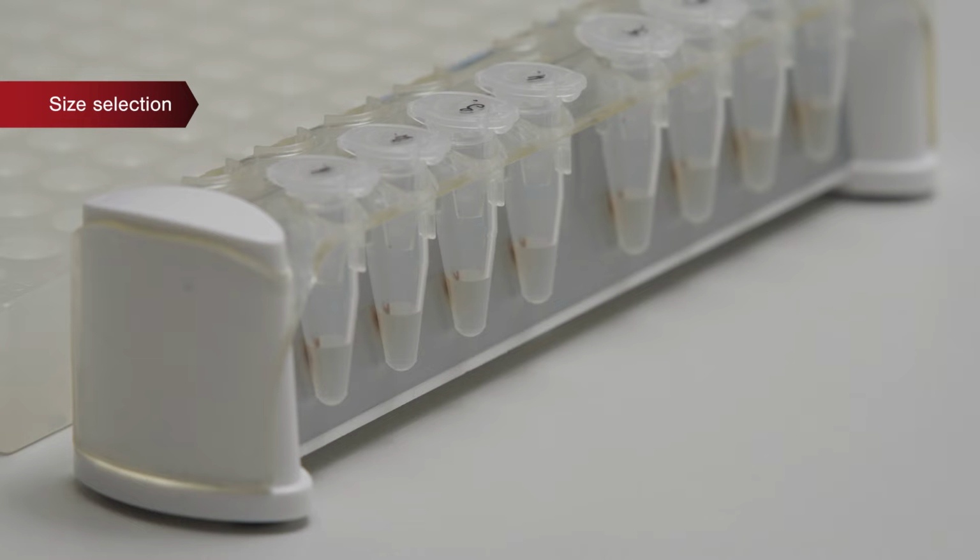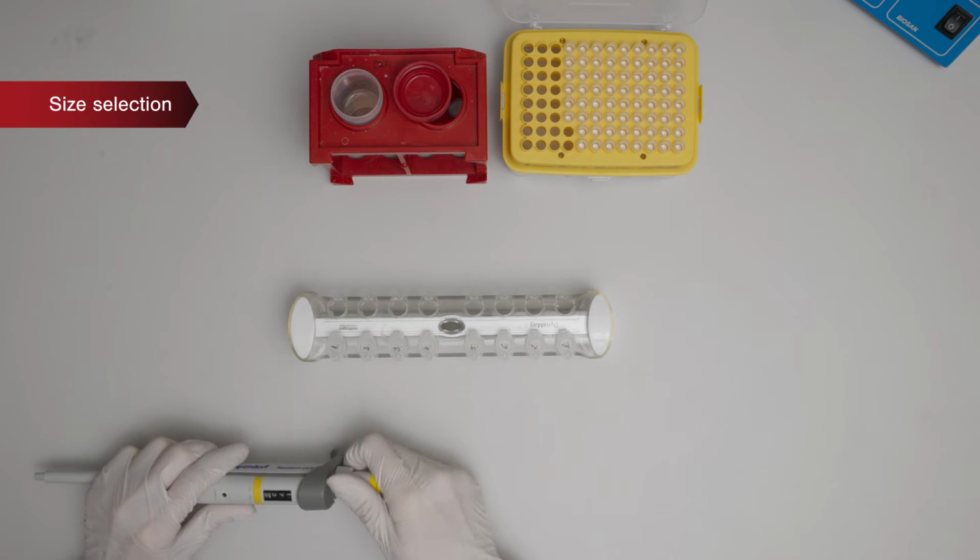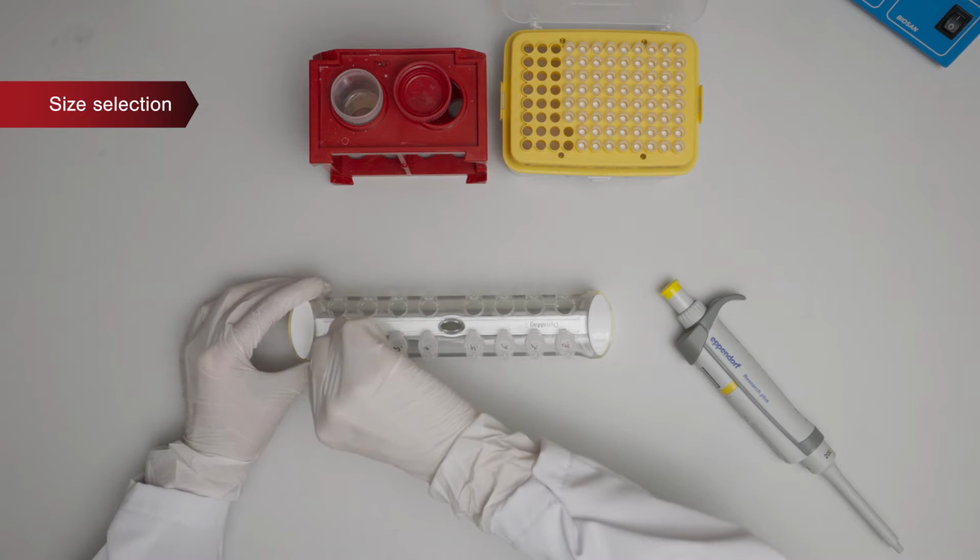After 5 minutes of incubation at room temperature and 2 to 5 minutes on the magnetic rack, the supernatant, together with fragments that are too short, is carefully discarded without disturbing the beads.